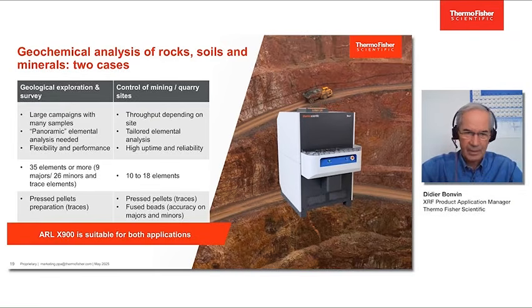So in these cases, either press pellets can be prepared in order to detect the traces at best, or fused beads in case the most important is the accuracy on the majors and minors, which is the case, for example, in typical iron ore mining.